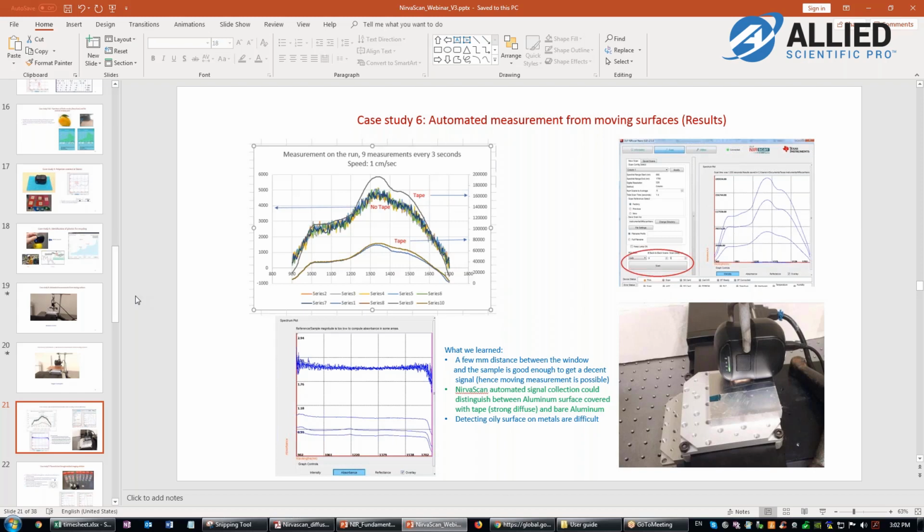It can be made into powder, because there's a gradation of sizes, and of course you can reduce it down to 2 millimeters. Yeah, in a powder form, because you wouldn't want to just put in a half-inch rock. You see what I'm saying? Right. It wouldn't work. So it should not be a problem then. If there is a near-IR signature, it should be able to measure it. I'm not particularly sure about asphalt because I've never done a measurement from asphalt, but if there is an NIR signature, the instrument could definitely measure it in a powder form.